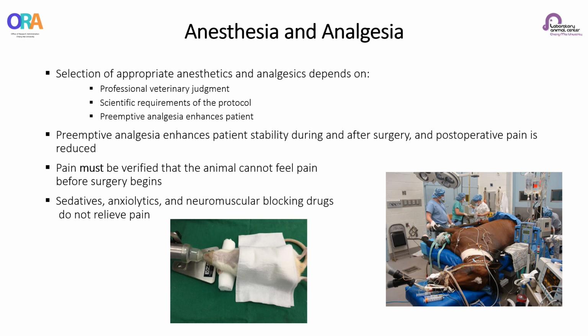Sedative, anxiolytic, and neuromuscular blocking drugs do not relieve pain. That's important. However, they may be useful in combination with analgesics and anesthetics to provide balanced anesthesia and to minimize stress in the animal. Any use of a neuromuscular blocking drug must be evaluated by a veterinarian, and the appropriate amount of anesthetic must be ascertained prior to using the neuromuscular blocker.